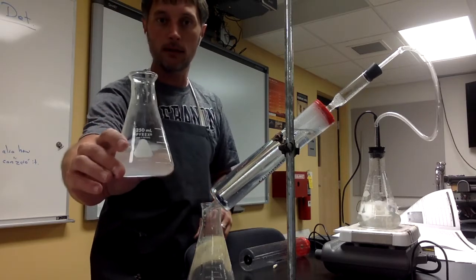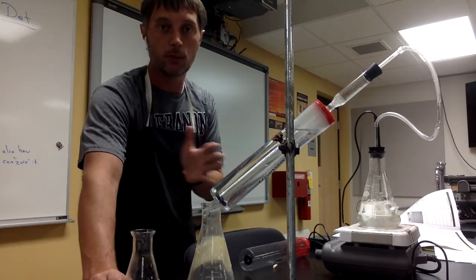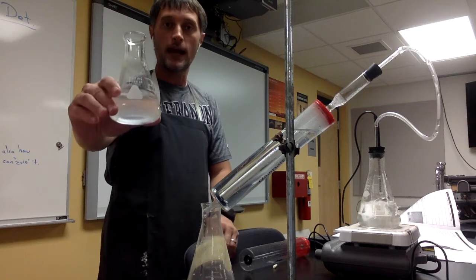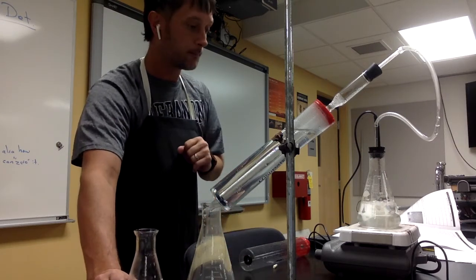I know its boiling point. What could it be? And then maybe we'll have to do some further testing to eliminate 1 or 2 possibilities, but we're down to just a couple. So that's distillation. Look for the results.